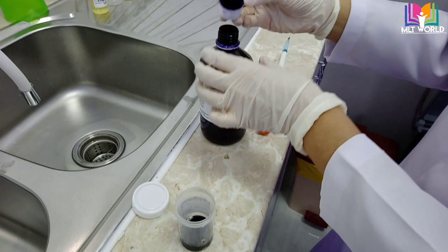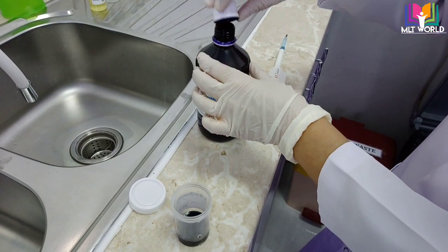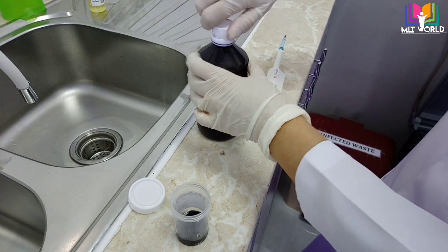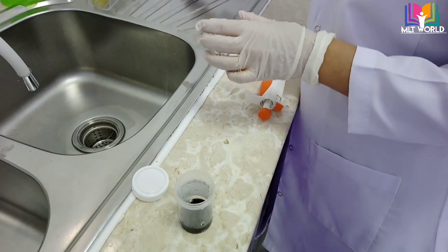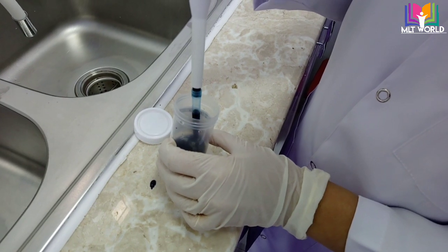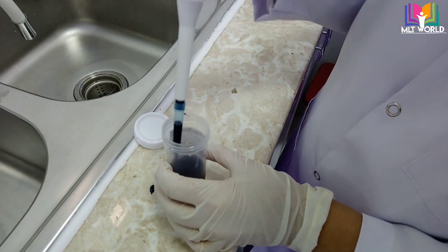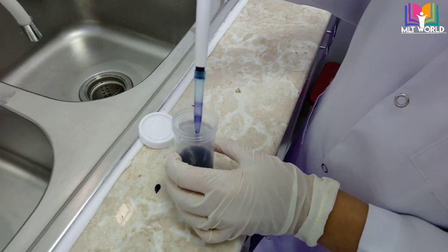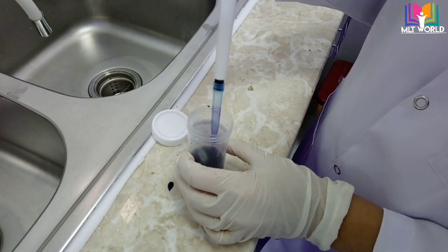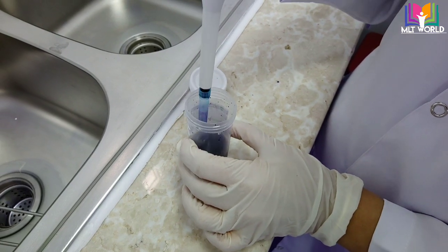The remaining stain transfer into the container. Be careful — this stain, if it falls on cloth, is very difficult to remove. With the help of a pipette or dropper, move the stain in a figure-8 position, and your buffer-stain is ready to use.